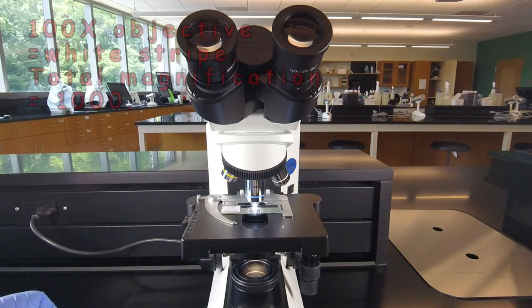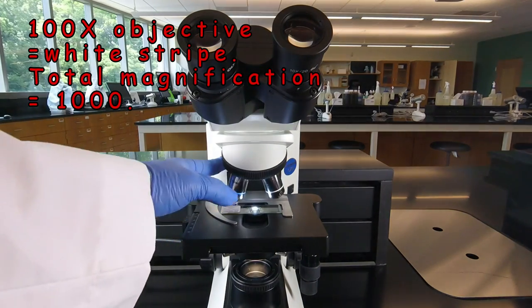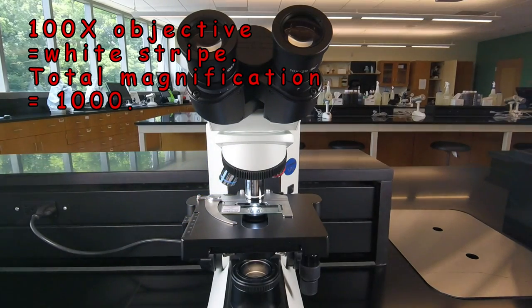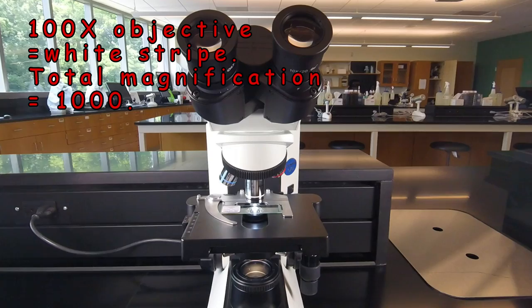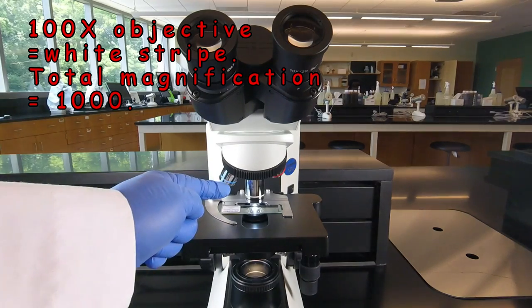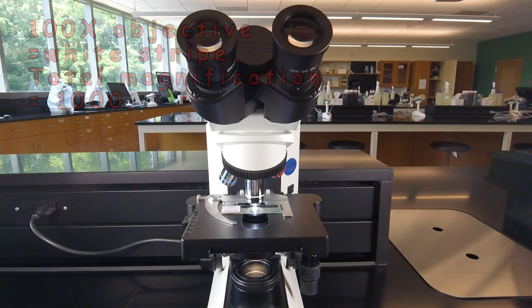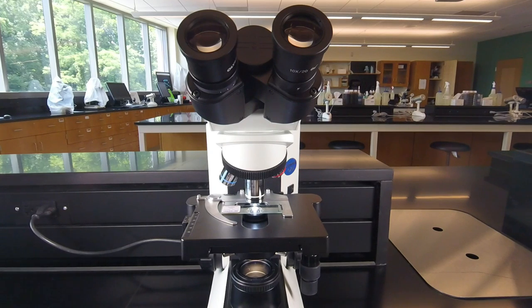And finally, and most frequently in this class, we're going to be using the white striped 100x oil immersion objective. So the total magnification there will be 100 of the objective times 10 of the eyepiece. We're seeing the image 1000 times its real size. Now that lens has to be placed in a drop of oil on the slide.